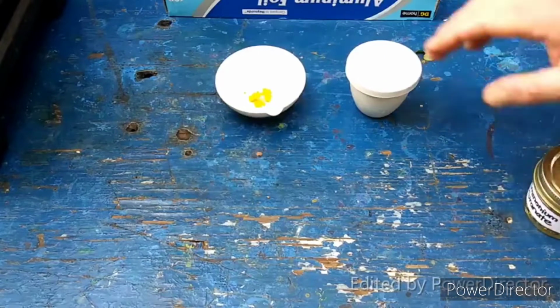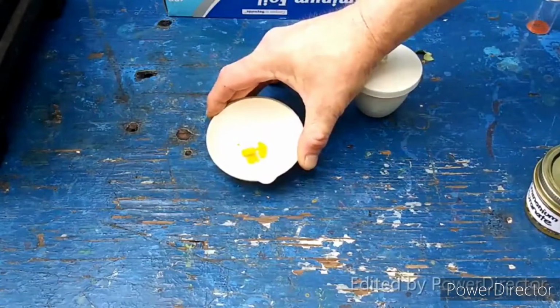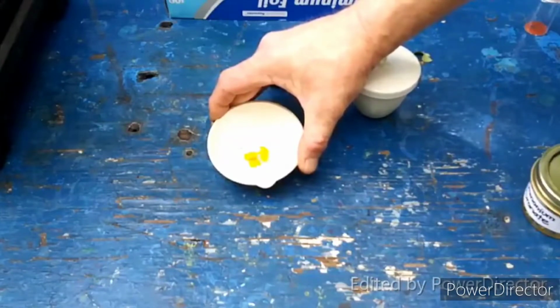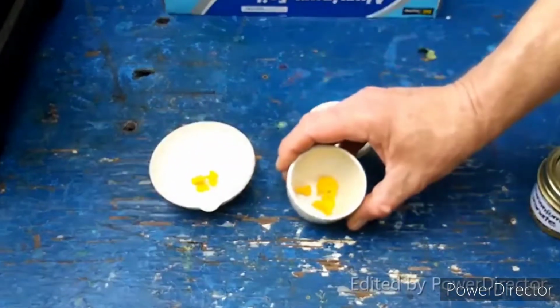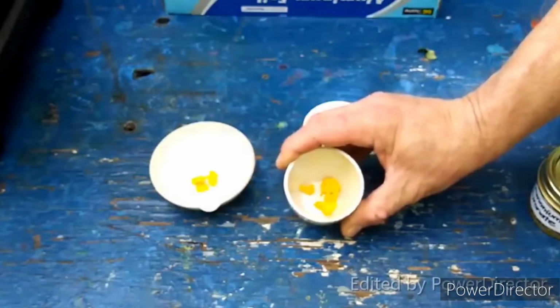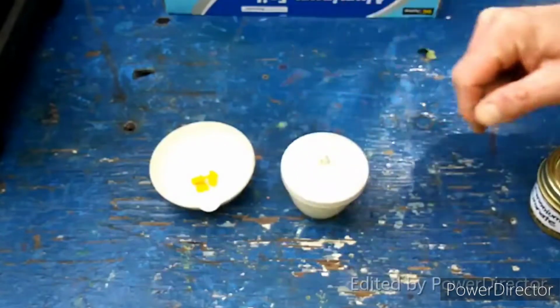U3O8. In order to make uranium trioxide, according to atmoistry, you have to heat this, like I previously mentioned, under 300 C. Again, no idea how long it actually takes. Let's hope it's only a few hours at the most. To make urano-uranic oxide, we are going to have to heat this up to 900 C, which I'm really hoping that my Meker burner is up to the task.